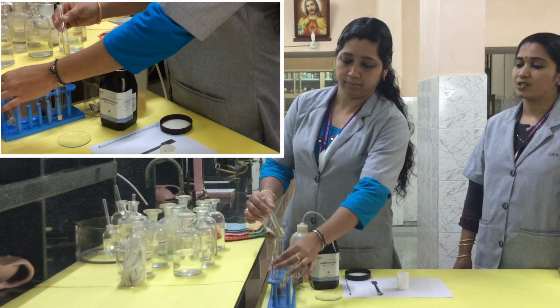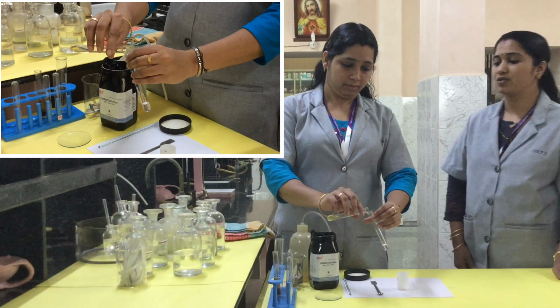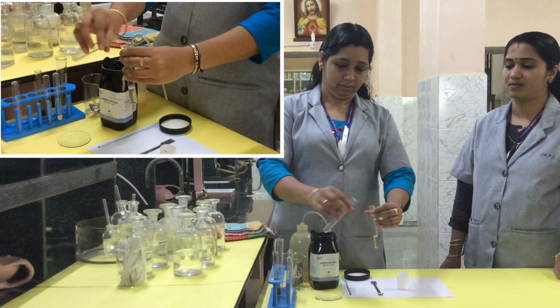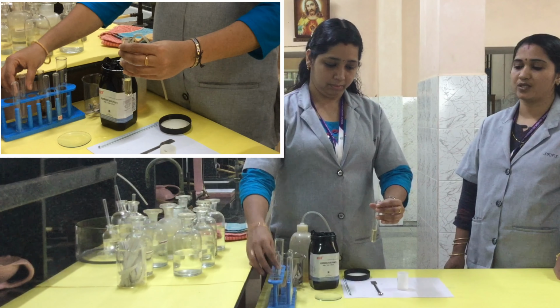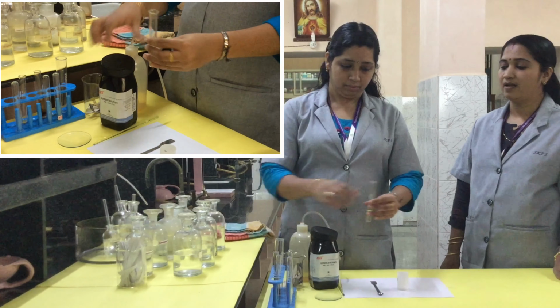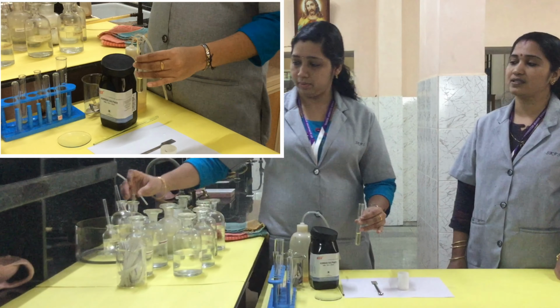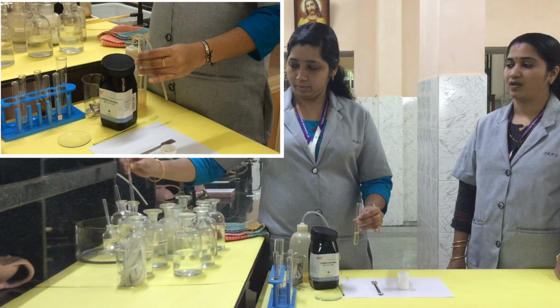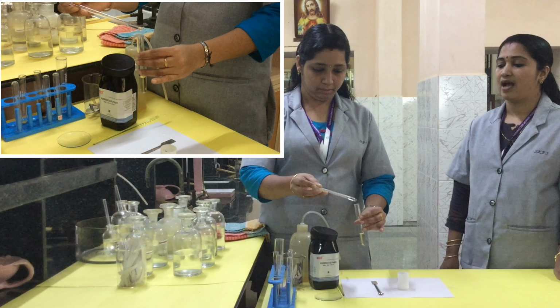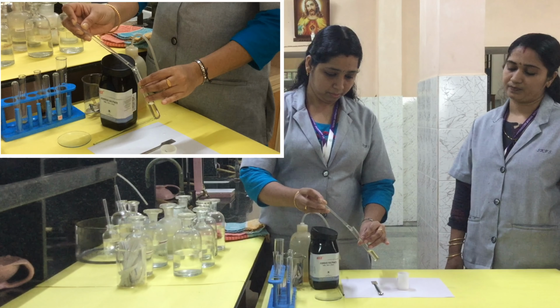Then take the salt solution that you have already prepared. Take equal volumes of the solutions you prepared and mix these two solutions well. Then shake it well. Then add concentrated sulfuric acid along the sides of the test tube.